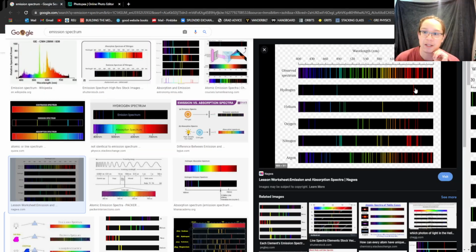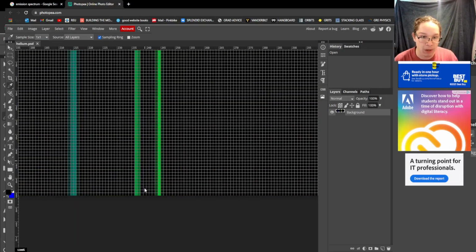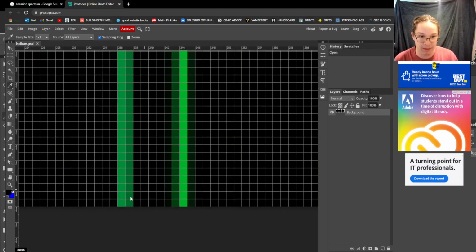What I did is I took each of these bands and made them each 700 pixels long. And that was really important because the code is running for 700 pixels, 700 steps. Then with each of those pixels, I wanted to make sure that they are pure black besides these bands. Like, you see how this green is slightly a different color green than the one next door? That's okay. That's fine. Doesn't matter too much to me.